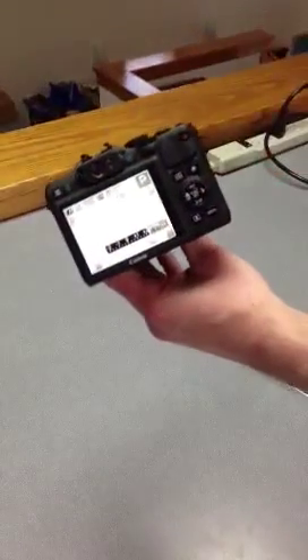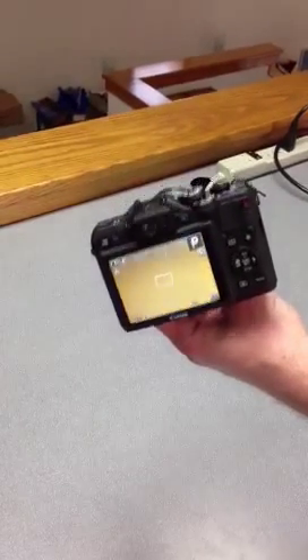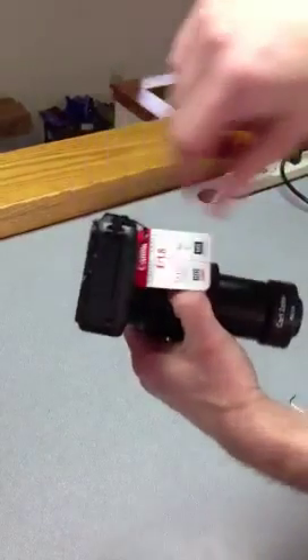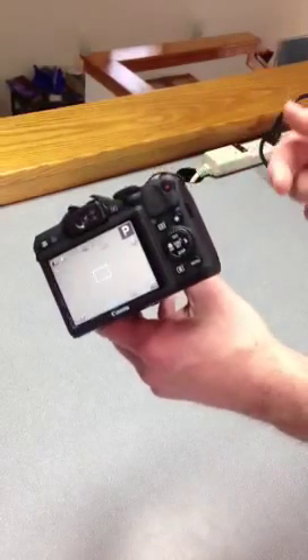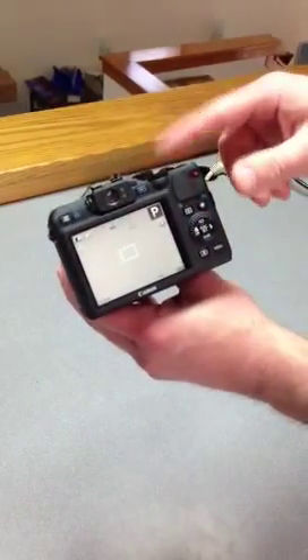The camera comes with a remote control. It's going to be much easier for you to take pictures by pressing the remote control than by pressing the actual button on the camera. The remote control just plugs right into this side panel here, and then you can operate the camera by pressing the remote control. That way, you're not shaking the camera by pressing it directly.